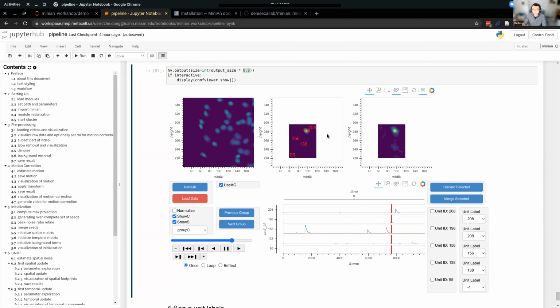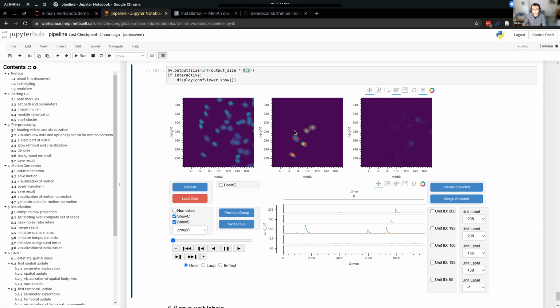If you prefer this, it can be kind of cool: if you go to different frames, you see different cells light up in the modeled activity, and you see that match up with the raw video. That can be helpful, but even without it, this can be helpful.